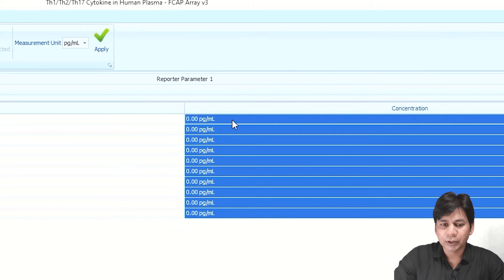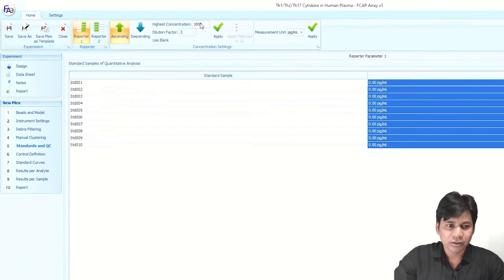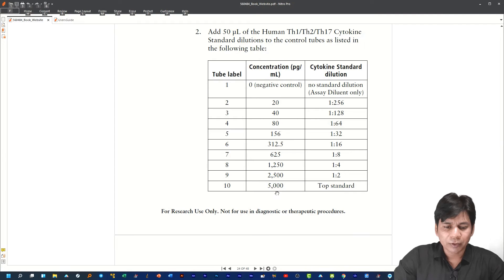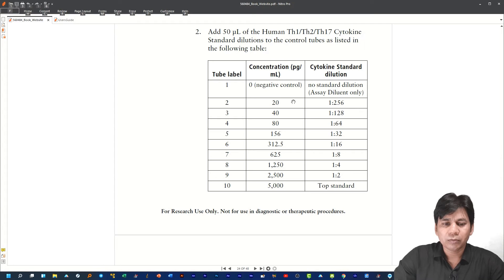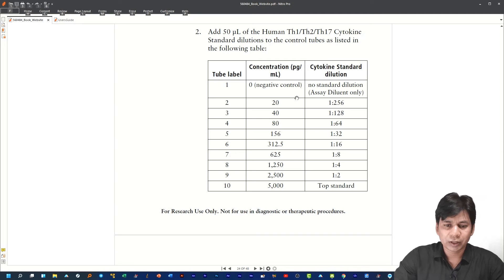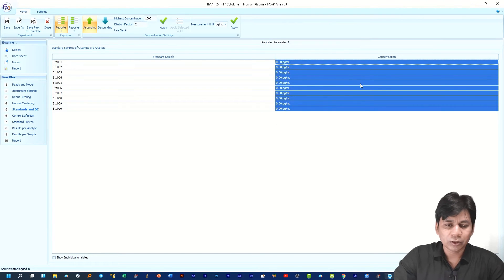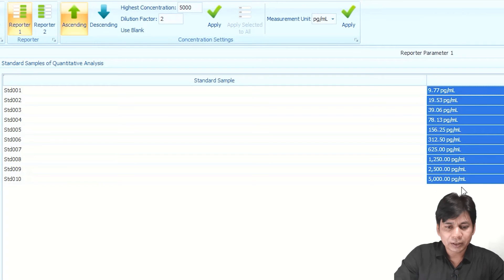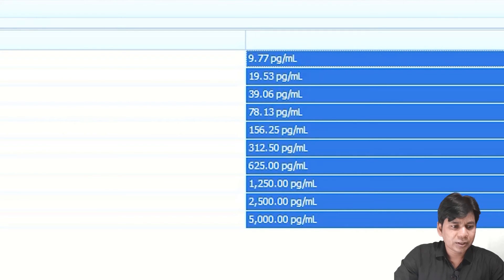I am showing you the concentration of the standards provided in the kit. The highest concentration is 5000 pg/mL and the lowest is 20 pg/mL with a dilution of 1:256. We prepared an additional dilution of 1:512 down to 10 pg/mL, but you can prepare up to 20 pg/mL. In FCAP Array software, Standard 01 is the lowest concentration and Standard 10 is the highest. I am entering the value 5000 with dilution factor 2 and clicking OK. You can see it automatically assigns all standard concentrations.